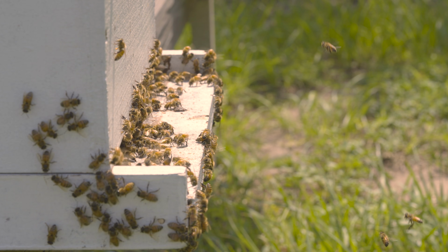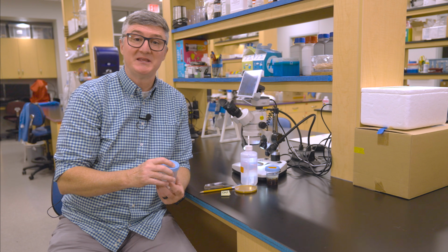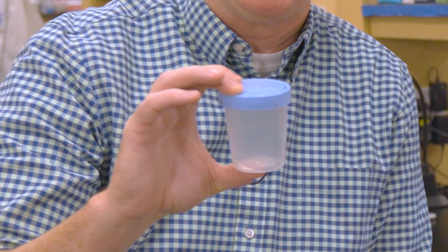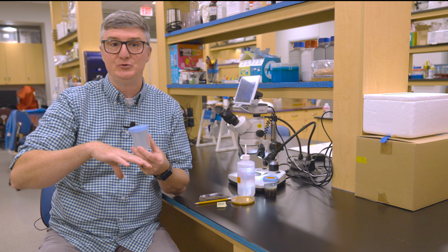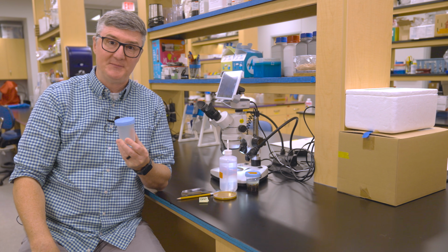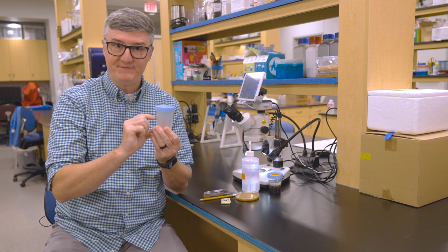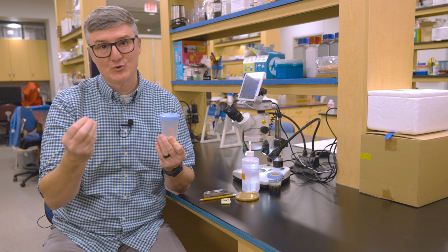What do you do to collect them? That part is simple. You just need a small container. This is just a little plastic cup that we have around the lab. You can use glass jars. You can use any other number of containers that have a good sealable lid. And all we do with this container is we half fill it with ethanol. Ethanol is the drinking alcohol.